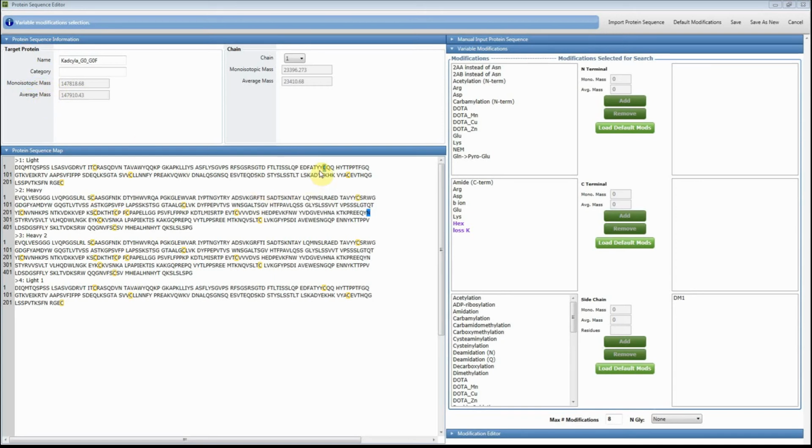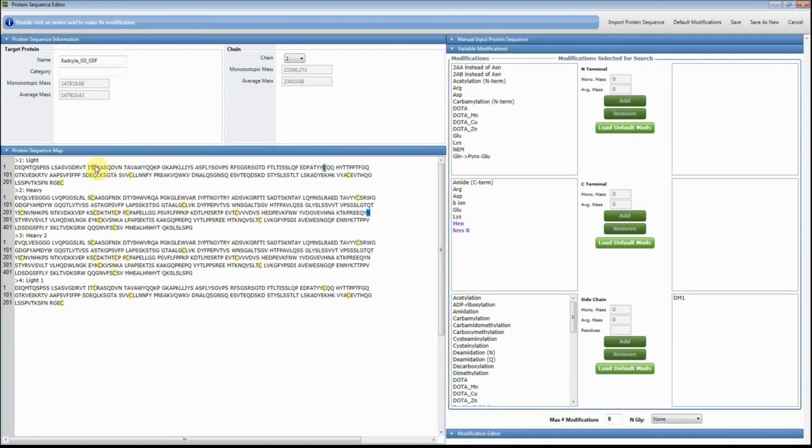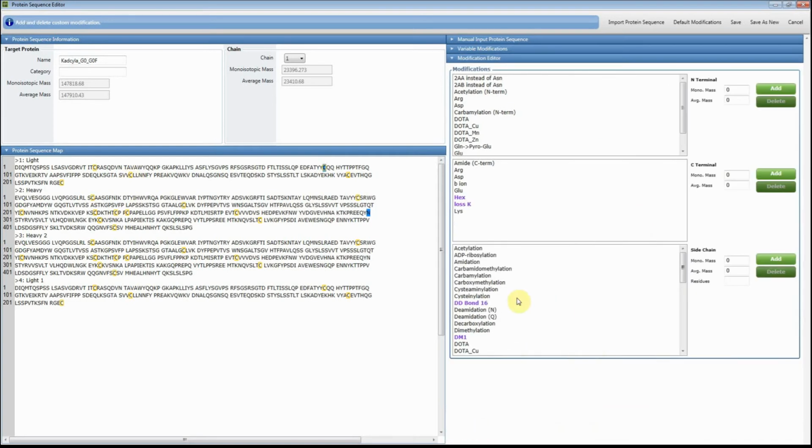Now you can go through and link together the disulfide bonds. You do get static modifications, but you can right-click to create a link of one cysteine to another cysteine, and you link them together. However, in this example, I've taken a little bit of a shortcut, and I knew that there were already 16 disulfide bonds in this molecule. And I know that whenever I form a disulfide bond, I lose 2 protons at the formation of the bond.